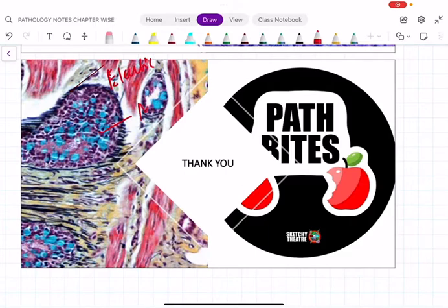What is this blue color? Mucin, very good. What is this yellow color? Collagen, super. What is this red color? Muscle fibers. Fine, and fibrin will be somewhat pinkish in color. So these are the 5 stains. That is why it's called Movat's pentachrome stain.